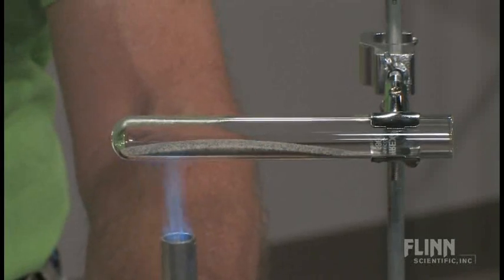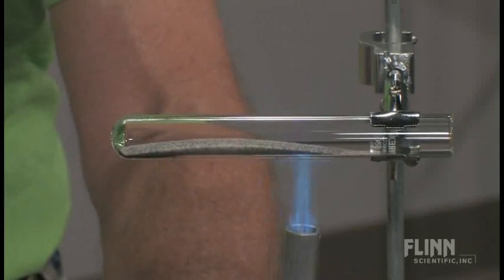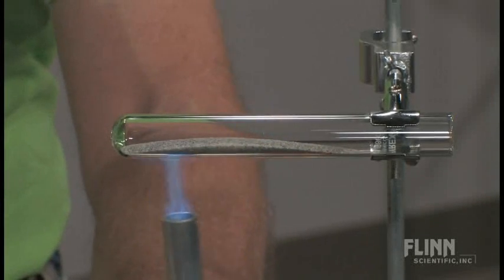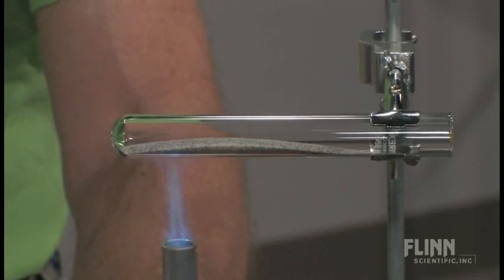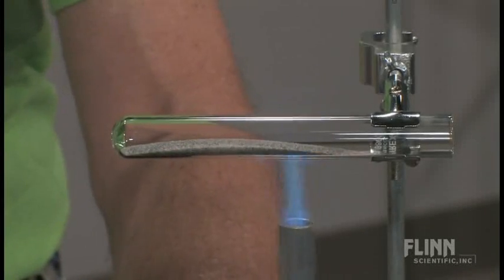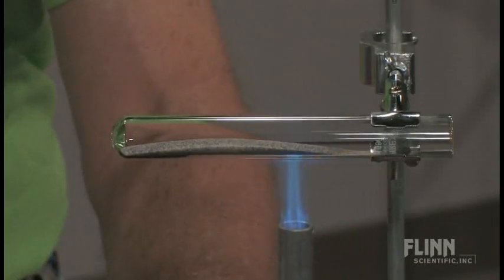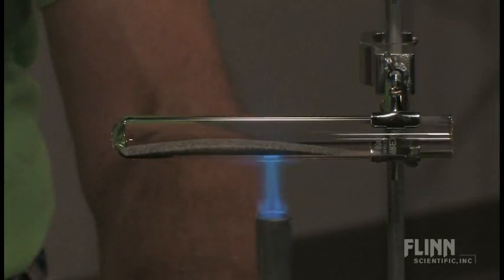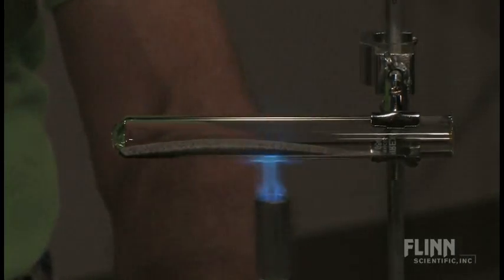So I'm going to heat this. This does take a little bit of time because I've got to get it really hot. And then once I get it good and hot, the reaction will take off. And it's kind of cool. So why don't we dim the lights to kind of dusk here. This is some of the coolest chemistry around.